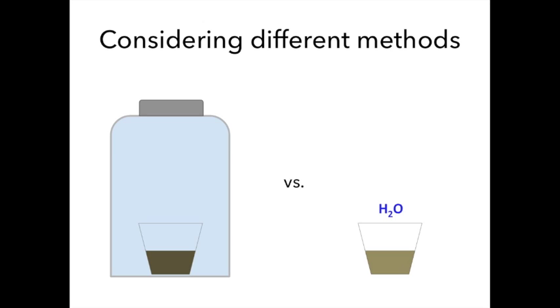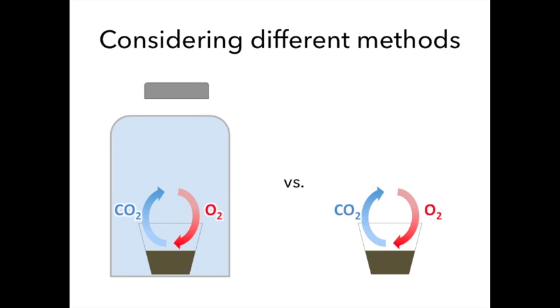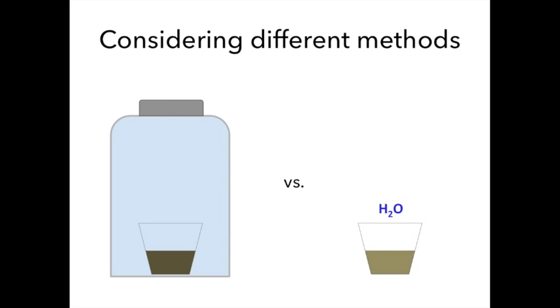One important consideration is that as CO2 builds up, it means that oxygen is being consumed. If too much oxygen is consumed, the soils can go anoxic, and that has big effects on microbial processes. It's important to avoid anoxia unless it is an explicit part of the experiment. That's why we flush our samples each time we measure, to flush out the CO2 and add more oxygen. When designing an incubation, considerations like these need to be made to determine the best method to use.